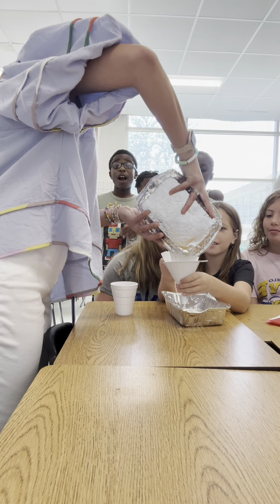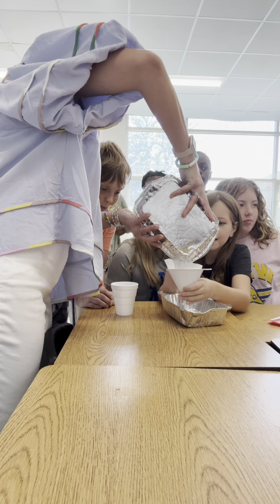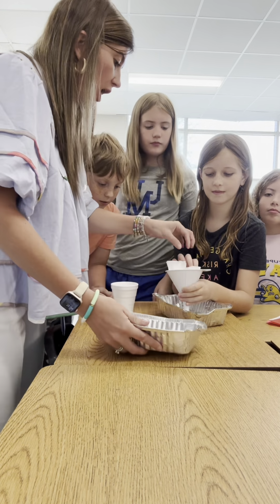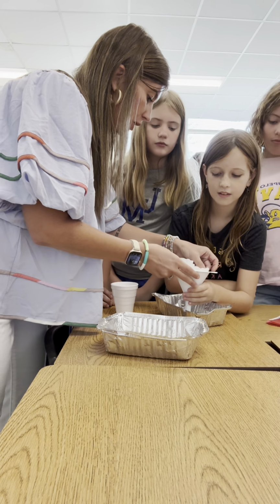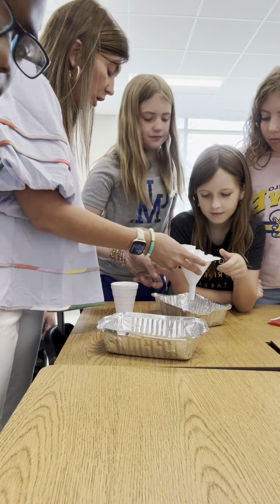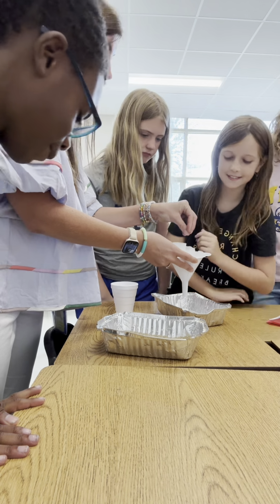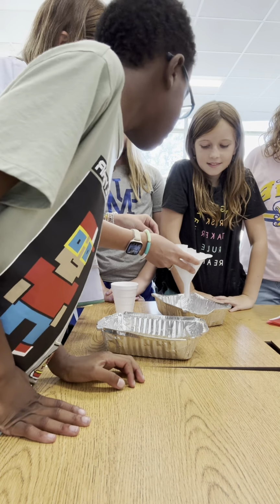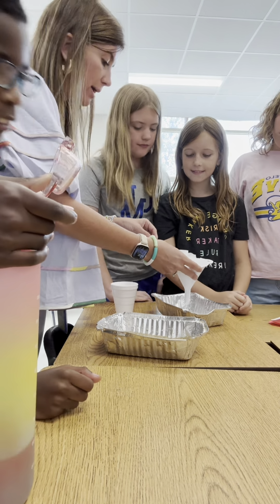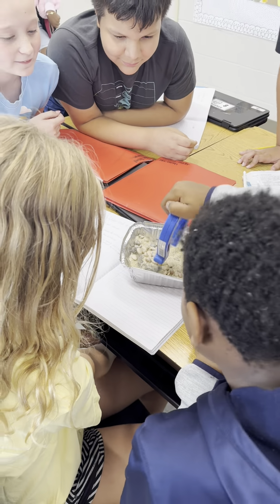Okay, and so if you come look a little bit closer, inside the funnel is the filter, and the filter has stopped the sand particles, but the water is still going through it. So the filter is able to keep the sand particles, the solid particles, from falling through, but the water is still able to go through it. And it's still going.